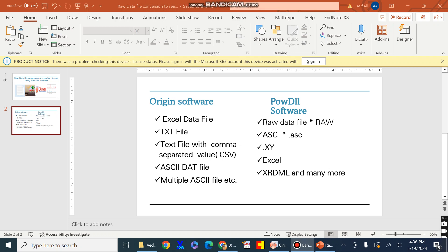However, files which are in formats other than these extensions cannot be plotted with the help of Origin software. First we need to convert them to a suitable format. With the help of this PowDLL software we can convert the raw data file as per our requirement and the software requirement.